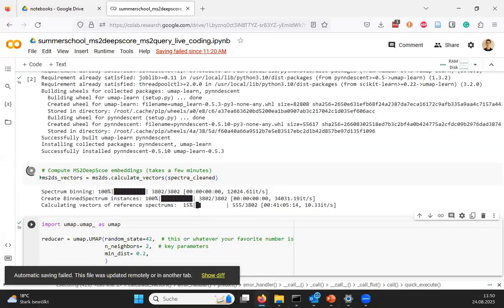And this will take some time. So we can wait for this to finish. It's not super bad, but it will take a few minutes. In the meantime, I can take questions if there are any questions on the scene so far. And we can also look at some trouble if there's trouble running the scene.